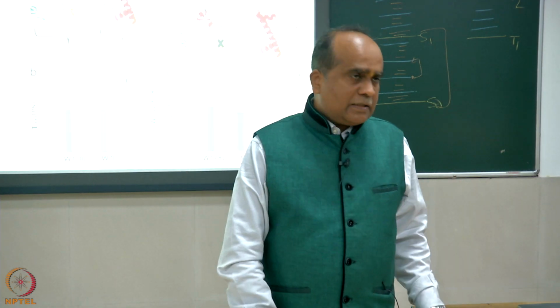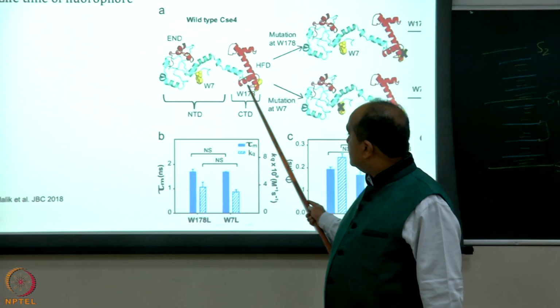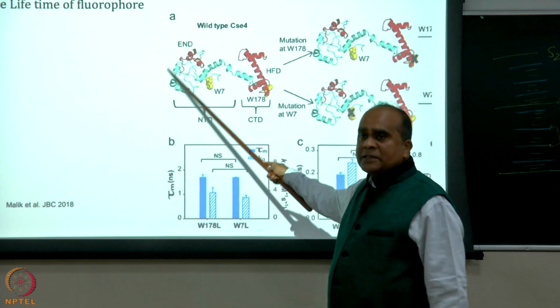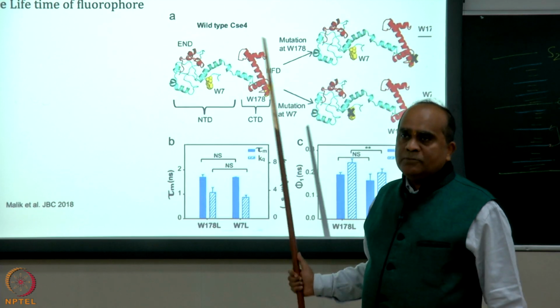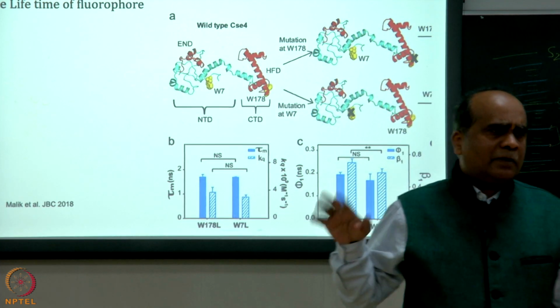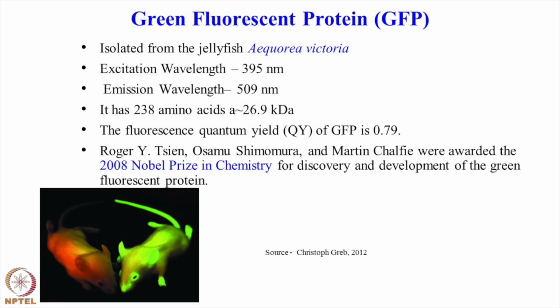For all the model structures, there is still no X-ray, NMR or cryo-EM structure for this protein, but whatever the model said, that this remains very free and this is very well structured, at least our data does not show that they are very different. There is some difference but not a significant difference. So, another quenching.